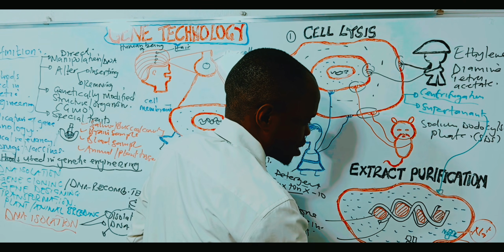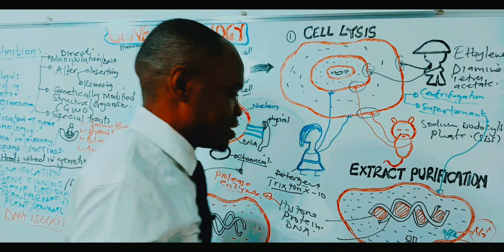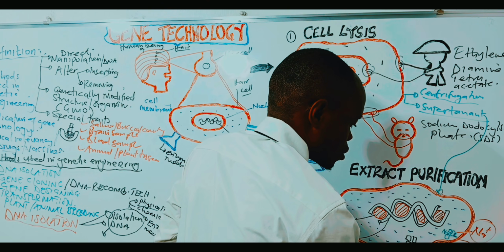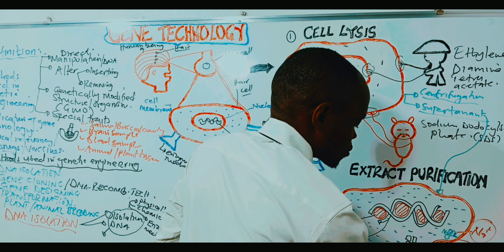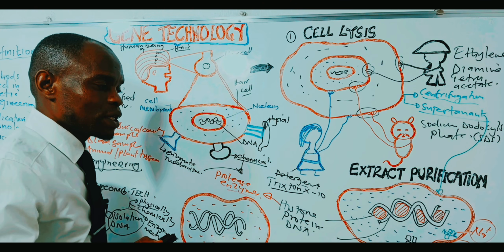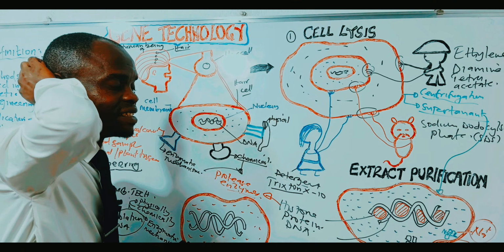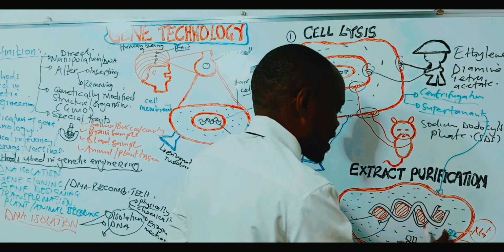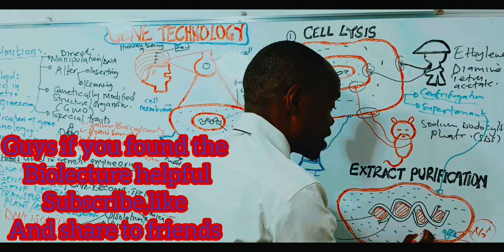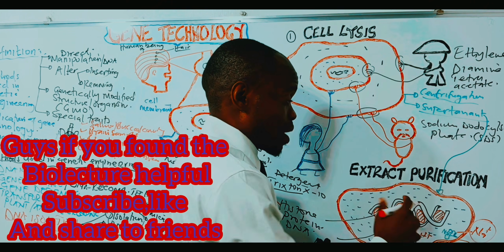What's going to happen is that this ammonium ion is going to work as a weak base. That means it is going to receive the protons from all the strong acids. So in case there was a very strong acid, it is going to be eliminated, because we have very many acids here from the nucleic acid, from the RNA that was also broken down.